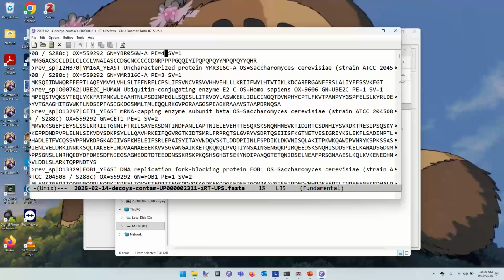Okay. So FASTA databases are big text files. They have lines like these that say, hi, I'm a new sequence. So if you see a greater than symbol at the start of the line, it's giving you the accession for what this protein should be called. It's got some sort of description that gets tacked onto the end of that. And then the rest of this is several lines of sequence. Okay? Those are literally the chains of amino acids that comprise this particular protein.